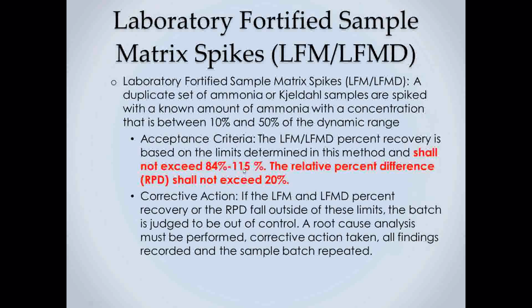And that's not to say the LFM and LFMD work done is not accurate, but this is basically, again, saying we want to make sure we have really tight limits, and these are very achievable with the instrument. We see no problem with that. If you fall outside of this, though, the 84 to 115% recovery and RPD shall not exceed 20%, if you fall outside of that, then it is judged to be out of control.